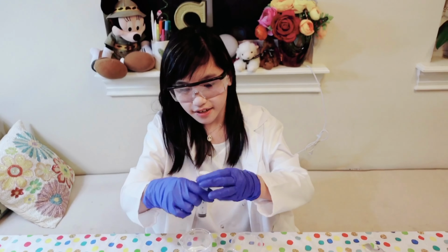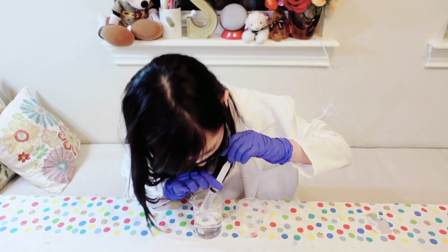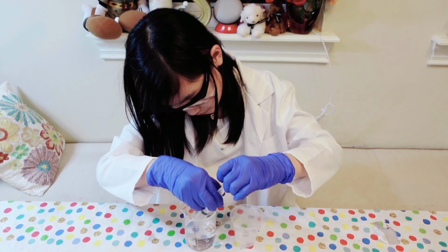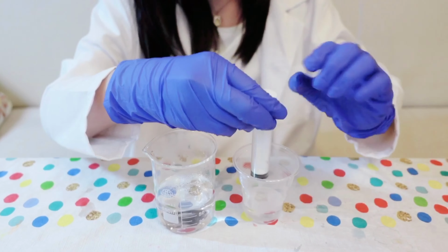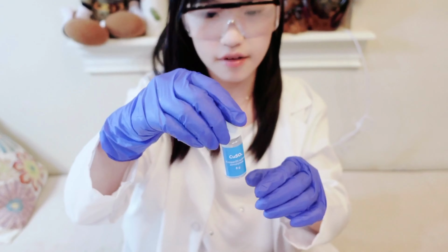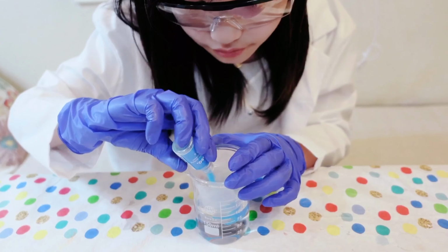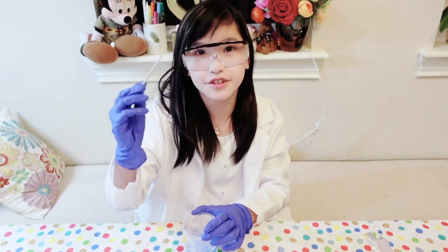Okay, so I'm gonna get 20 milliliters. I'm gonna use the syringe to transfer the hot water to the plastic cup. Now I'm gonna put this plastic cup into here, and I'm gonna get the copper sulfate pentahydrate, 1 bottle of it. Now I'm gonna stir it with the wooden spoon for 2 minutes.